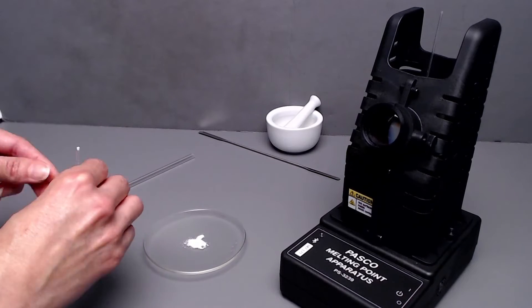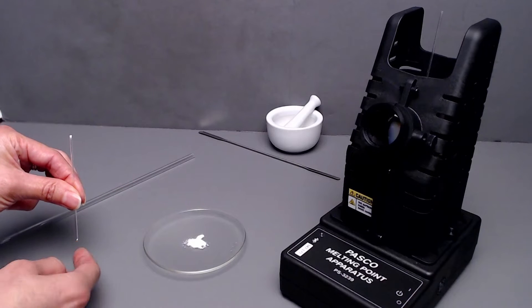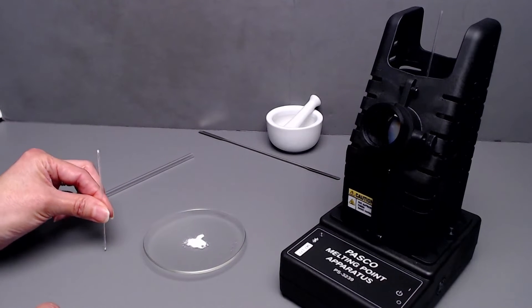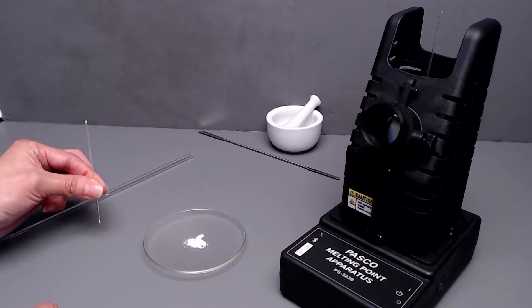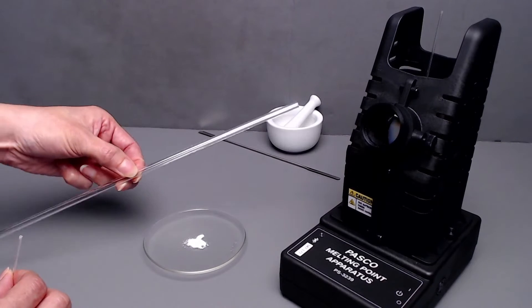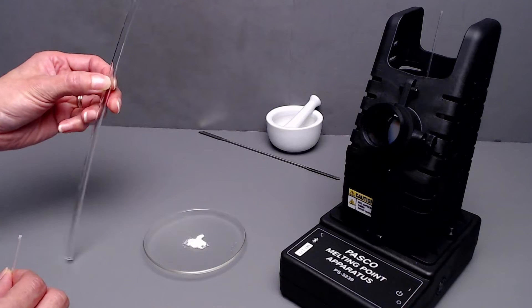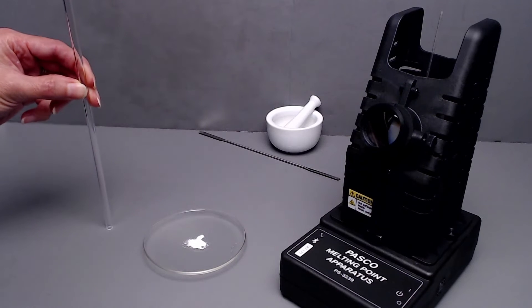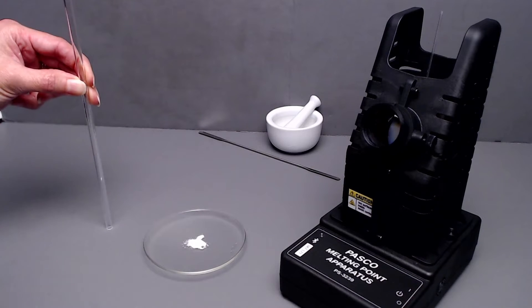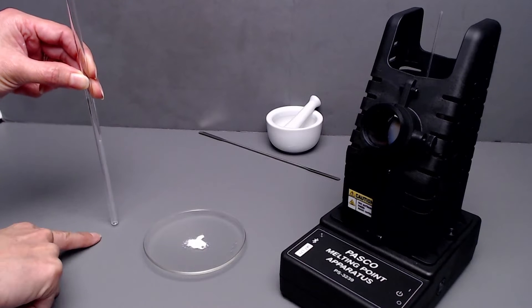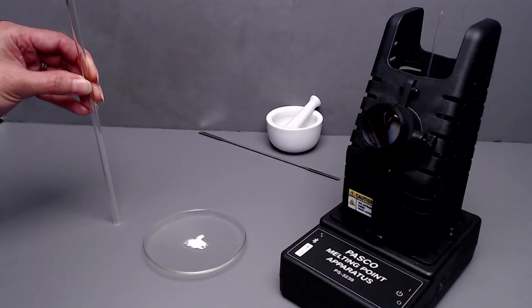Then invert the tube so that the closed end or the bulb is on the bottom and either tap the sample gently a few times on your surface, or if you have an open hollow tube, you can always drop the capillary tube in there with the bulb down and pack the sample that way.